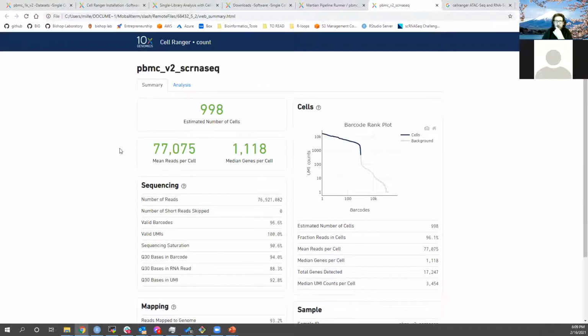So Ollie asked the question, why is the number of genes detected relatively low in single cell RNA-seq? We're going to talk about that. We're going to get to that. The short answer is zero inflation or dropouts, depending on how you want to say it, but the long answer is more complicated.